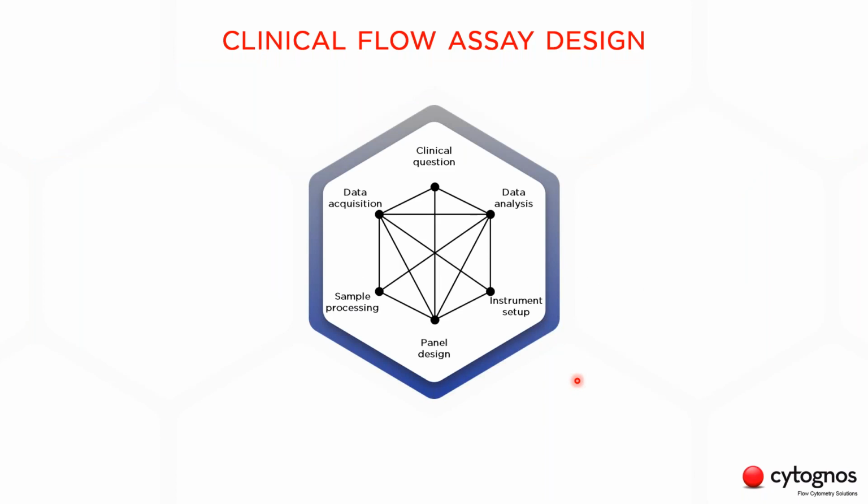So we know this is complex. Now, before introducing a new test in the lab, we need to carefully design and clinically validate the assay. And to design a new test, there are several aspects we need to keep in mind. First of all, the clinical question, because it is going to determine the panel design, the sample processing protocols, how we are going to process the sample, the instrument setting, how the instrument, the machine, is going to be set up, the data acquisition parameters, and data analysis strategy.